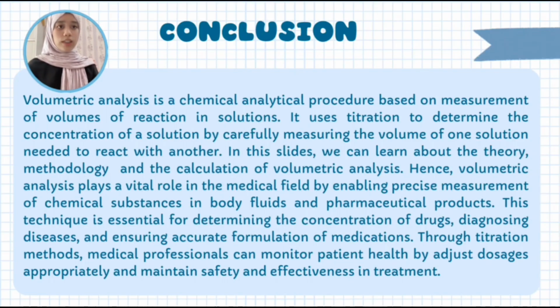Hence, volumetric analysis plays a vital role in the medical field by enabling precise measurement of chemical substances in body fluids and pharmaceutical products. This technique is essential for determining the concentration of drugs, diagnosing diseases, and ensuring accurate formulation of medication. Through titration methods, medical professionals can monitor patient health by adjusting dosage appropriately and maintain safety and effectiveness in treatment.